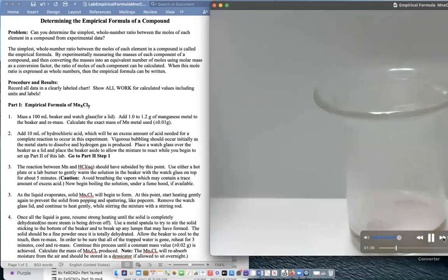Eventually, the bubbling would subside or start to slow down. And that's because you are using up the hydrochloric acid. So in kinetics, you have less of the particles of chloride that can collide with and interact with the manganese and start to bind to it. Notice that there is some vapor that is generated, and that again is why the watch glass is there.